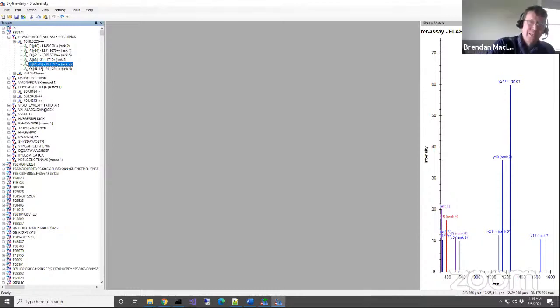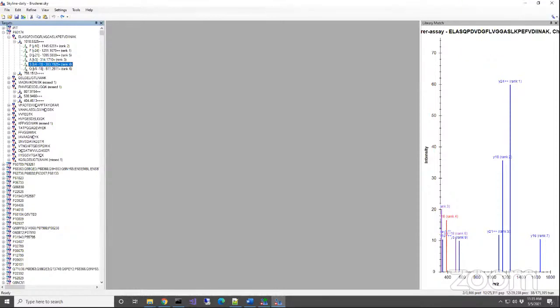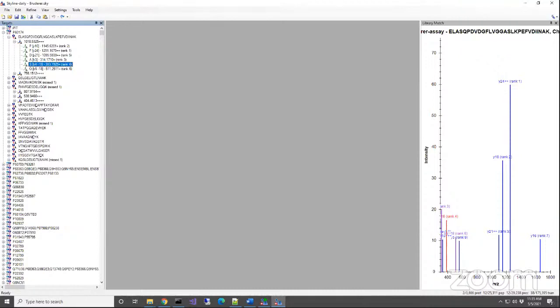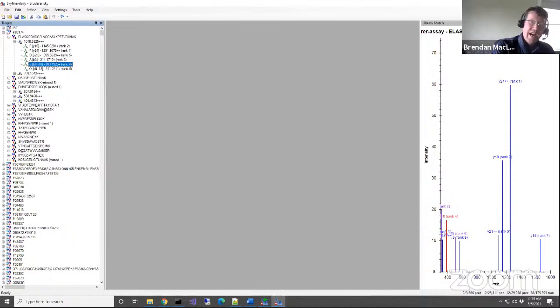Yeah, that's a really good question. I don't even know the answer to that. But I'll find out. I think it shouldn't, because you may have said it's non-quantitative for a reason. Nick is the one that implemented the non-quantitative transition. Before he implemented it, we were definitely considering all transitions. I agree that it would be a bad idea to consider them.